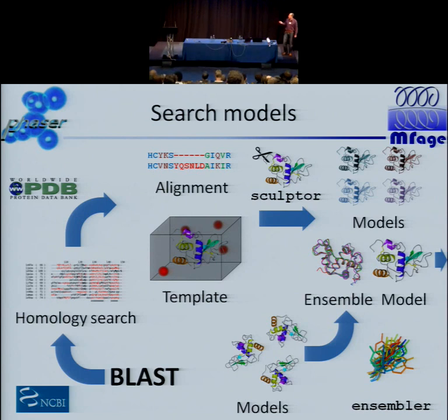If you don't even have a homology search, we have a way to do a BLAST search for you at the NCBI side. Now, BLAST is not a terribly good method for a very low sequence identity problem, because BLAST is losing efficiency at about maybe 25% sequence identity. So possibly the most common input, I would say, is the homology search. However, you can specify each at every stage, and the program is using the ones first that are closest to this end. And it is pulling each structure on demand.